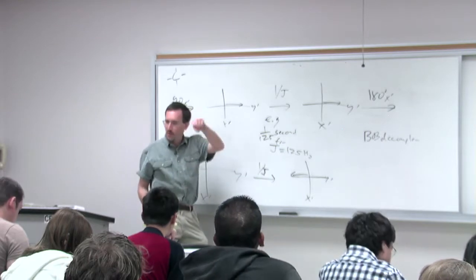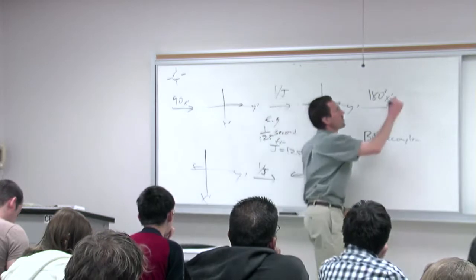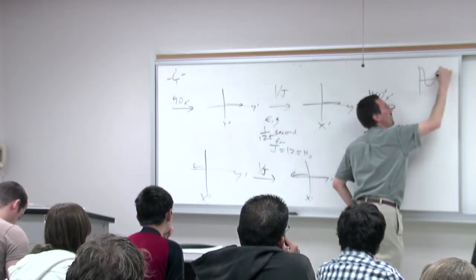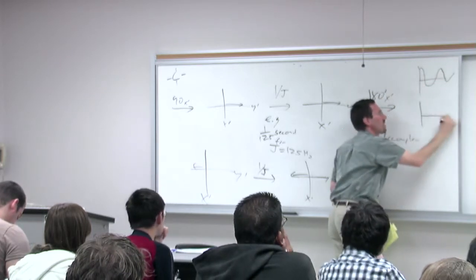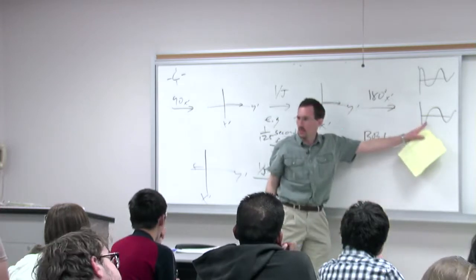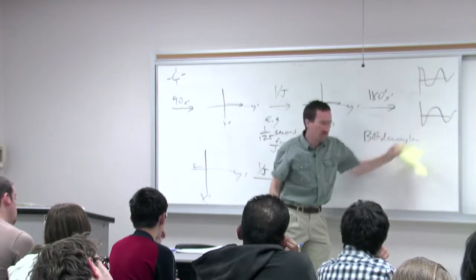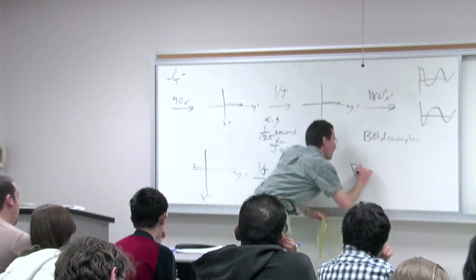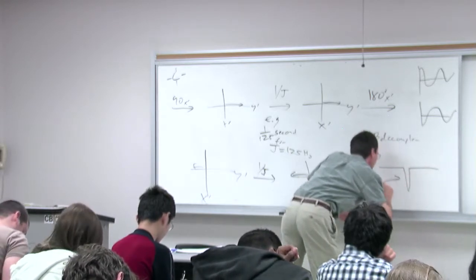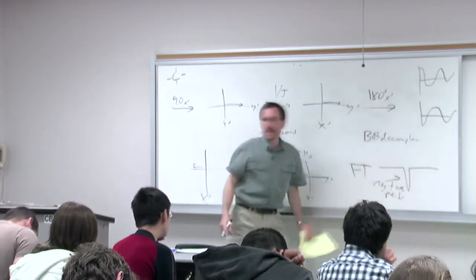That means if you're not in the rotating frame, you're a cosine wave. But remember how I've typically shown our cosine waves like this, where we start positive? If your cosine wave starts negative, which is what happens when your magnetization is along the negative axis, the Fourier transform is a negative peak. So here, when we Fourier transform, we get a negative peak, a line down.